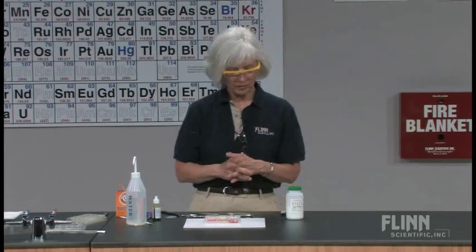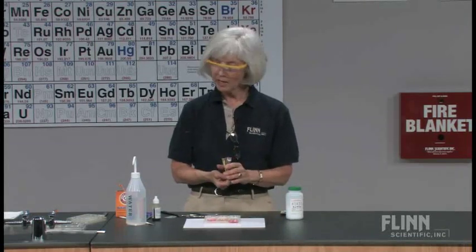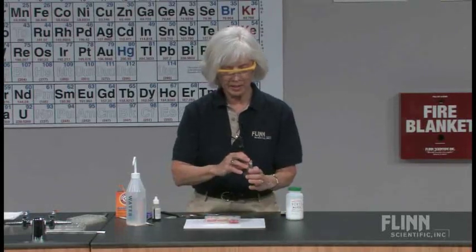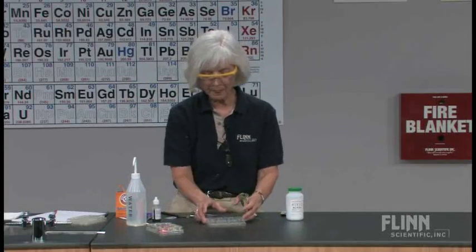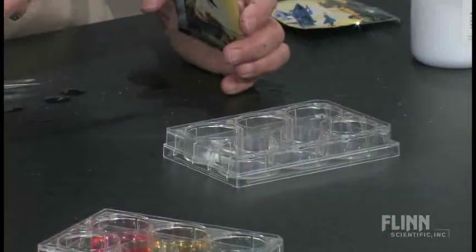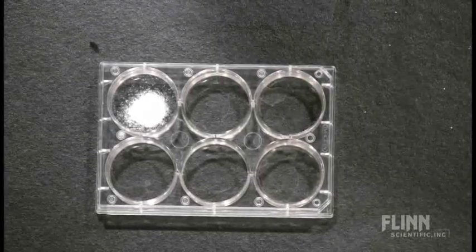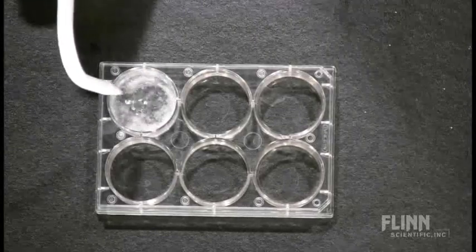All right, now in our bomb bag, we also have some solid left over. And what we're going to do is test that solid and see, is the solid just one of the solids that are written on the board? So what I'm going to do here is put some of the bomb bag solid, which you can see is a white solid, in there. And is it a mixture? Well, if it were a mixture of those two, sodium bicarbonate and citric acid, if I simply add regular water to it, I should get a gas.